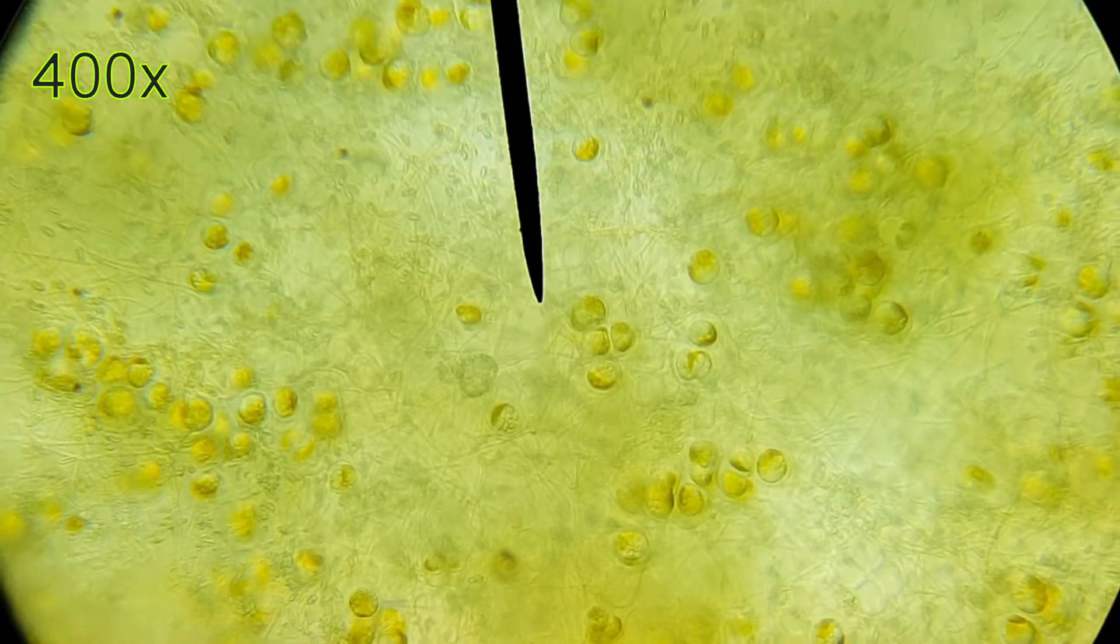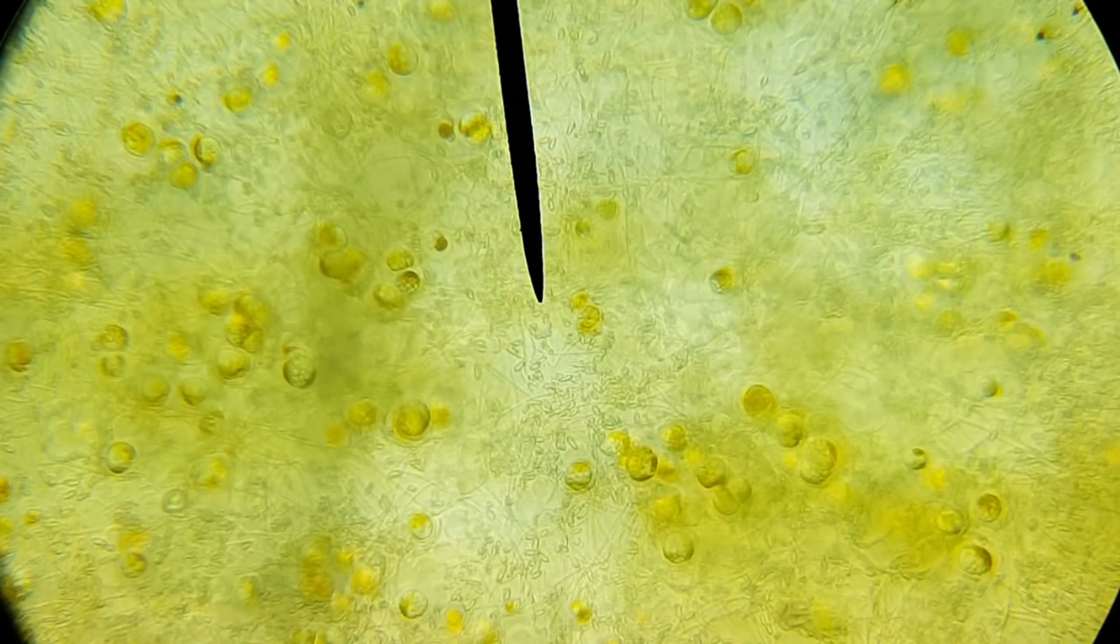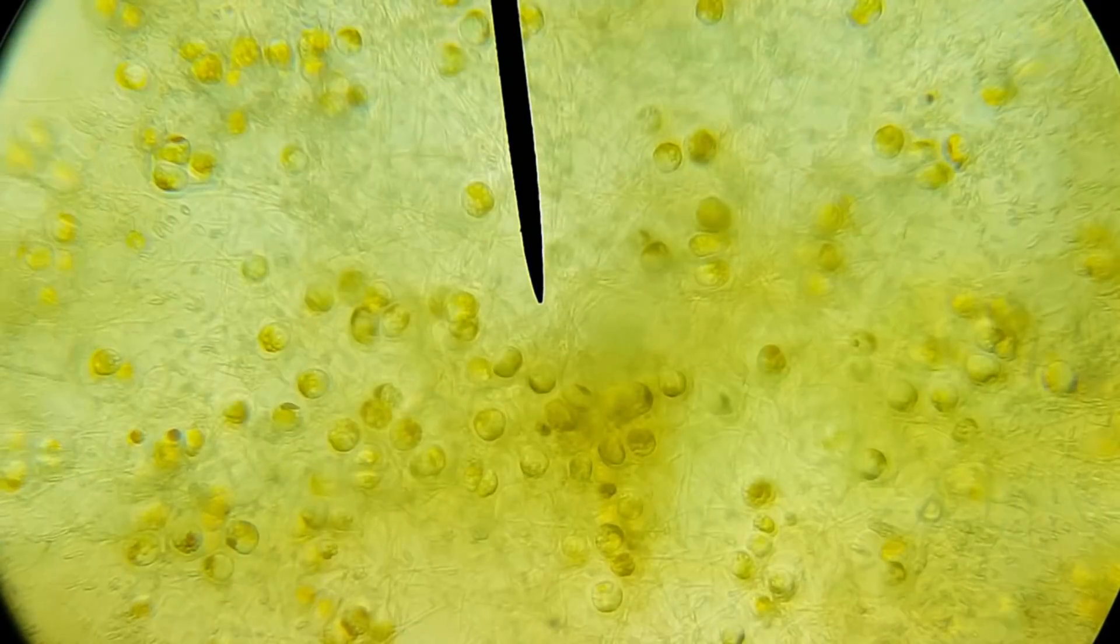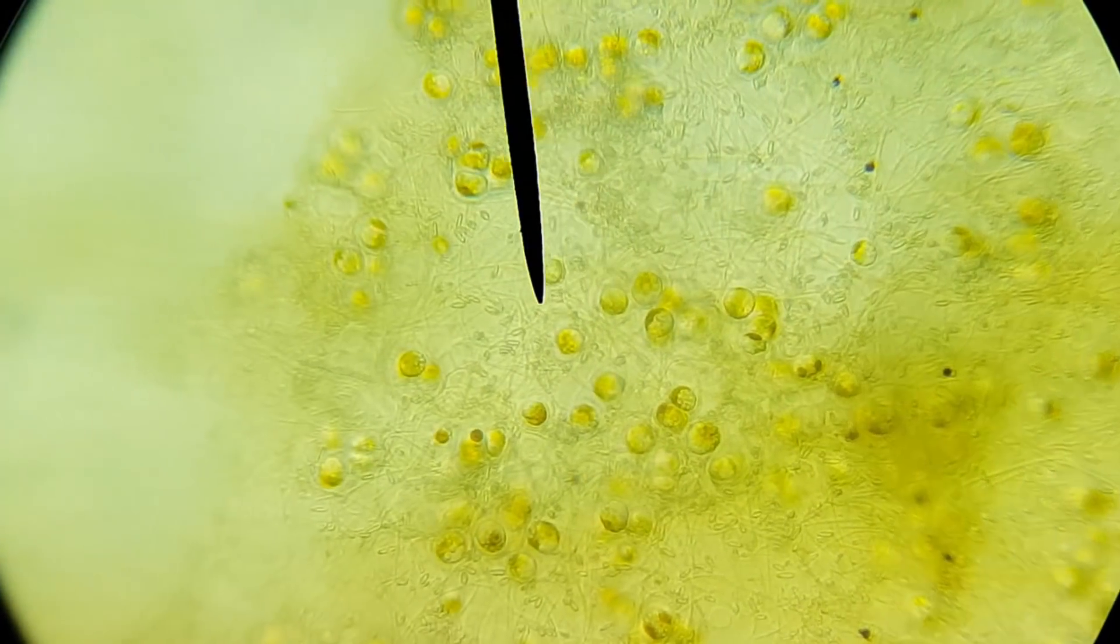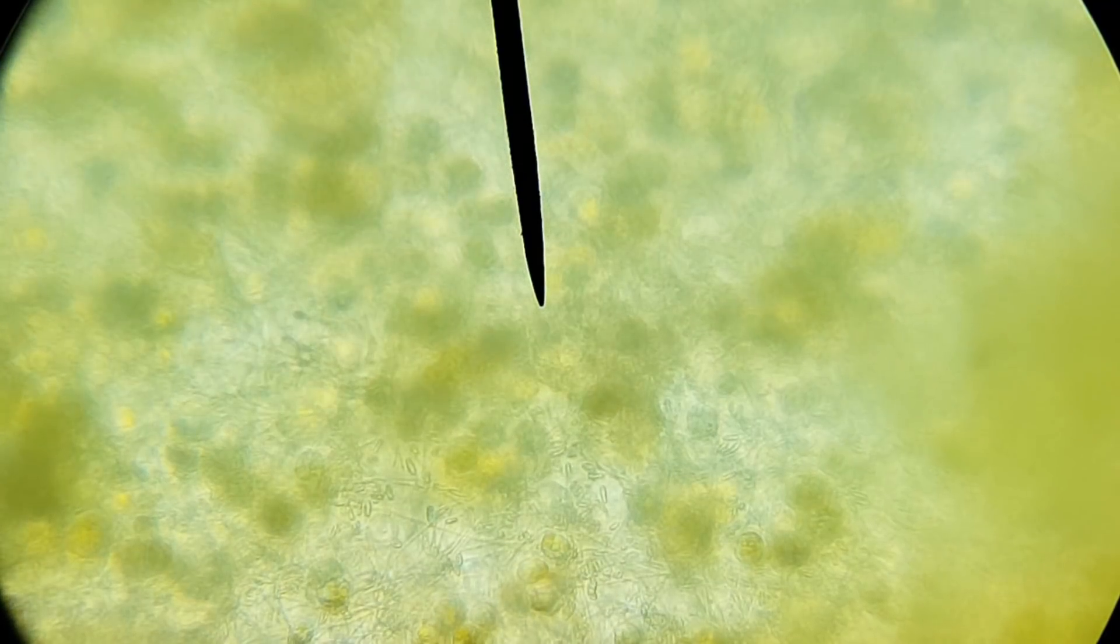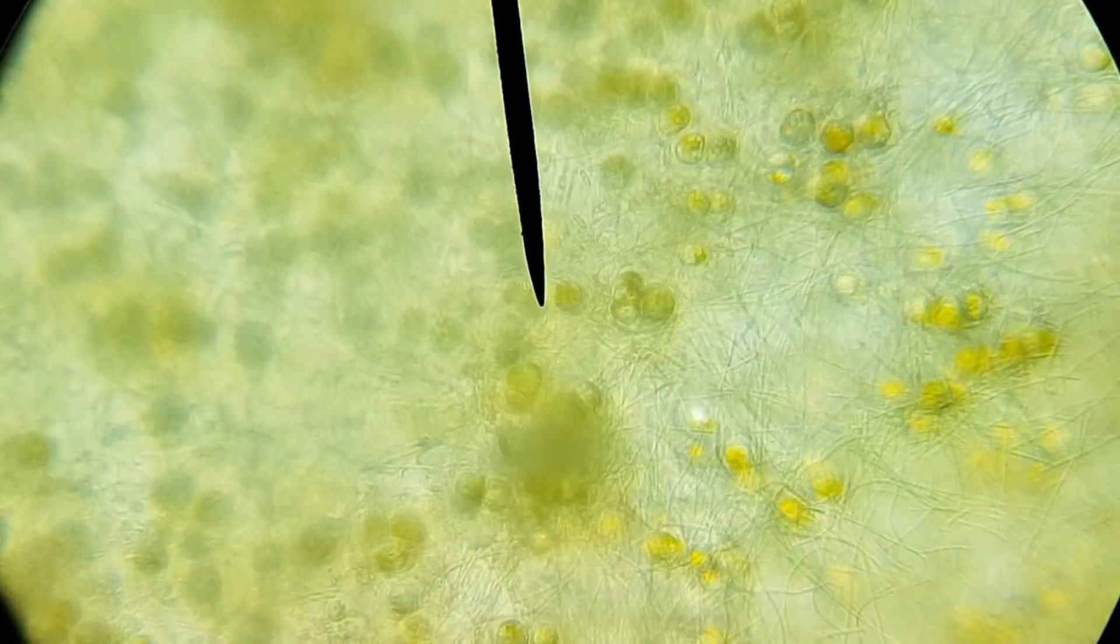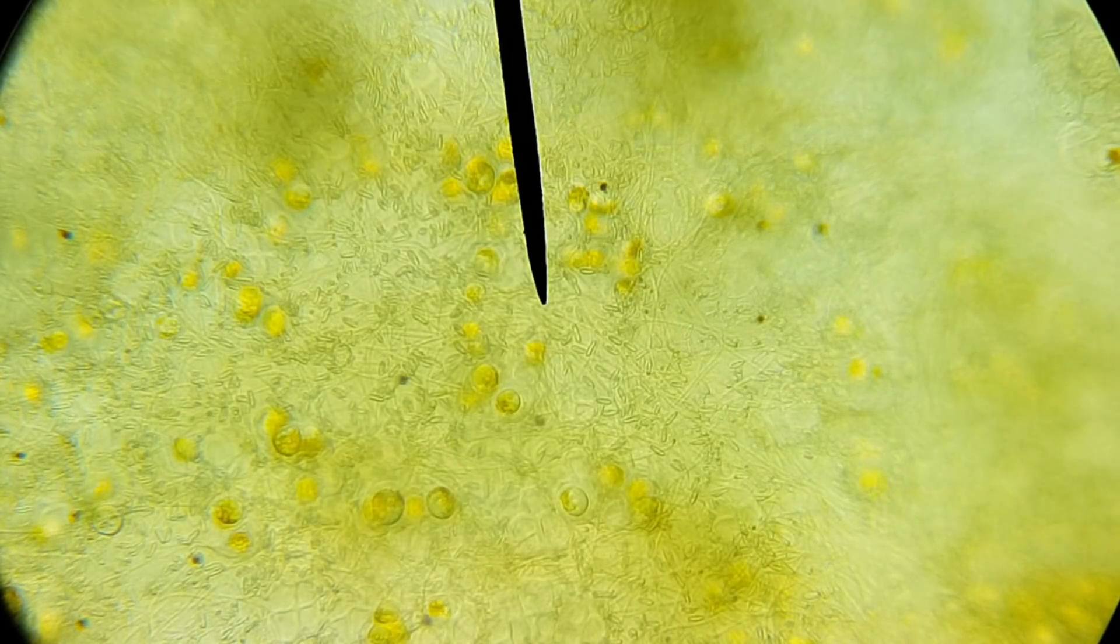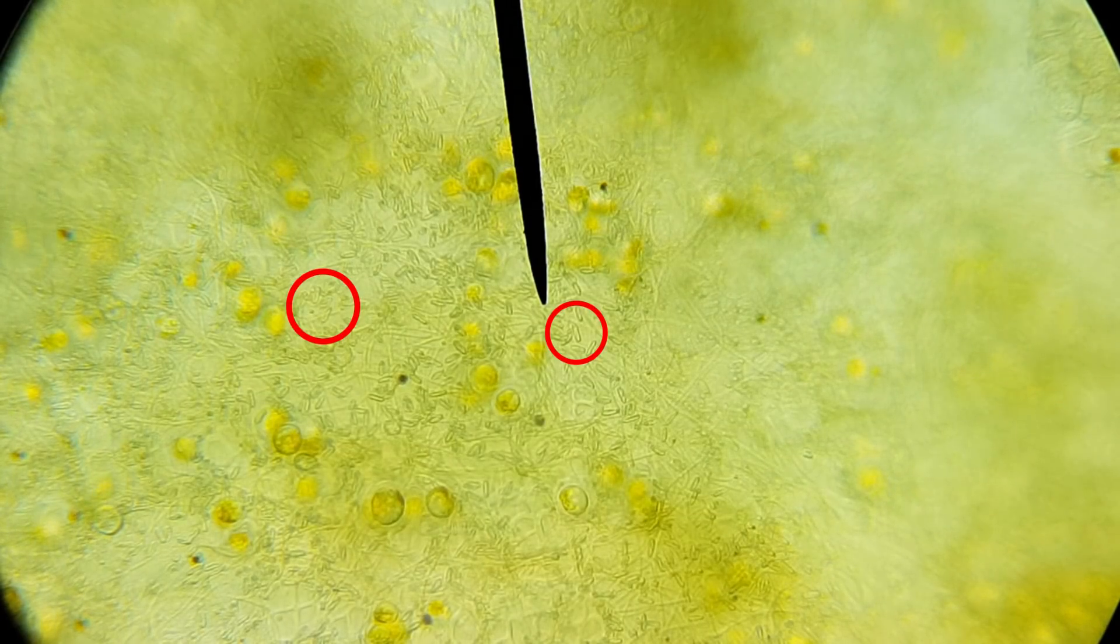I'm not so sure I understand the structure of this algae. It seems like it's a bunch of cells connected with a bunch of strings, or something that looks like a string. What I'm seeing way more of in this algae than in the other algae are all these little, these little, these little these. No clue what they are.